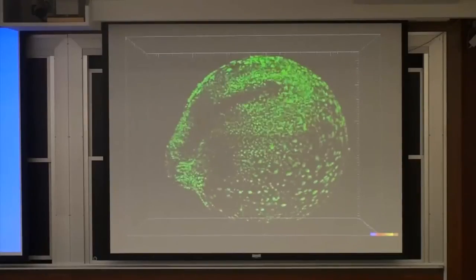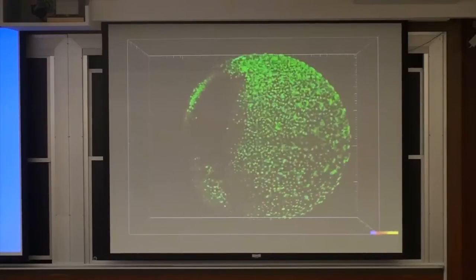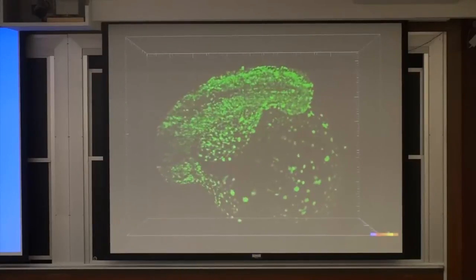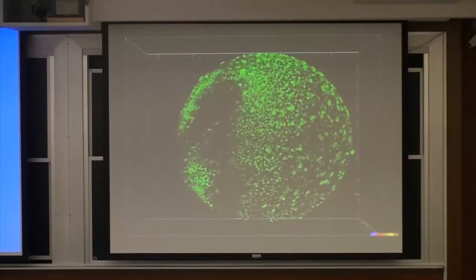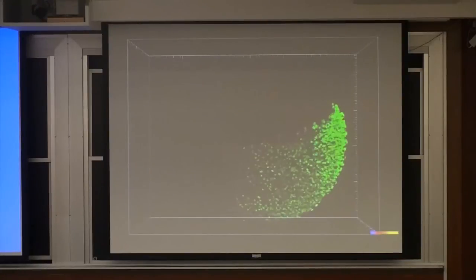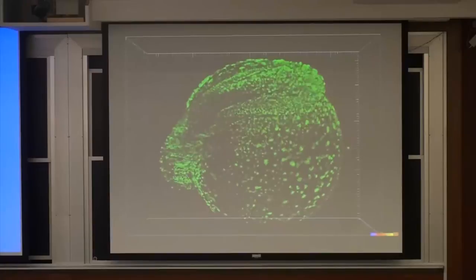Sure. So what is the focal parameter of the illumination? How much does it diverge along the axial direction? In the middle part, it is around 3 micron thickness. I have some objectives with which I can narrow it down, but then the sides are much wider, because as you focus it, particularly as I was interested in seeing that large field of view, I compromised in the width. The spread is around 3 to 5 micron. But for a particular application, if someone wants a very small field of view, you can take an objective close to 1 NA, where the divergence is very strong, but the field is very small and almost uniform.